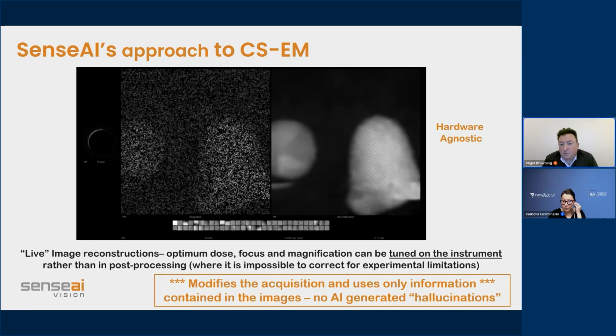Right, so we did some analysis of this. The way that a lot of it's easy to do is when you do the volume EM, and this is work that was done at King's by Roland Fleck. Essentially, we see higher resolution in our images because of the charging effects, the streaking of the charging. We can resolve the features in the image a lot clearer because we've got less charge going into the system.